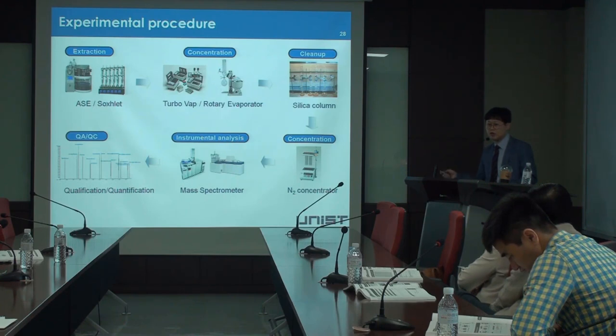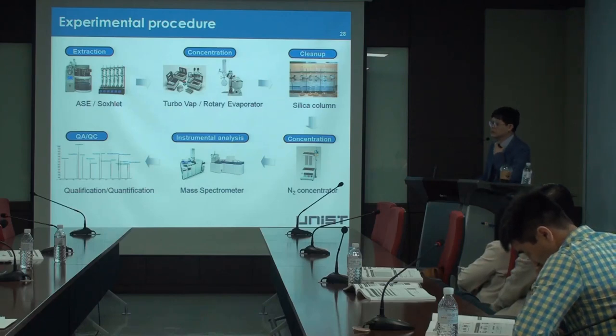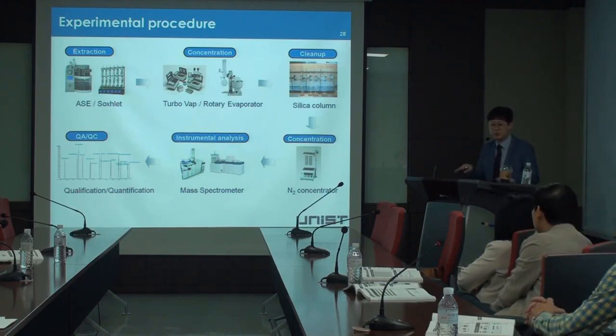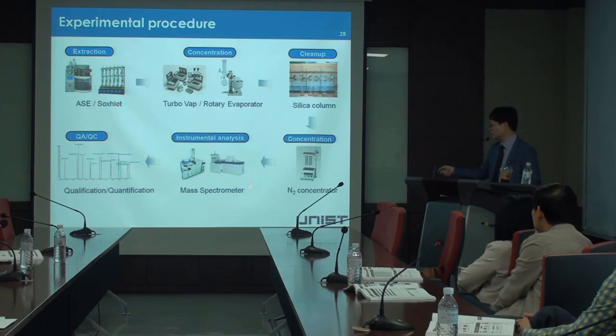Right now this is very basic. Some people still use GC-ECD or GC-FID for POPs analysis, but this is just for screening purposes. We can use those instruments, but right now we have to use mass spectrometers. And finally, quality control and quality assurance is required.